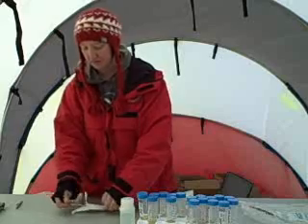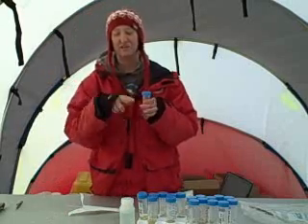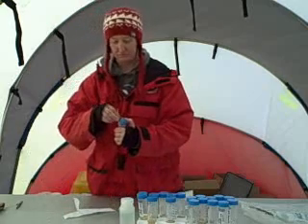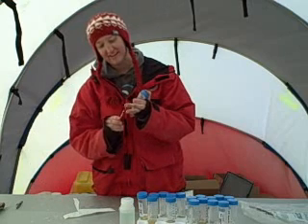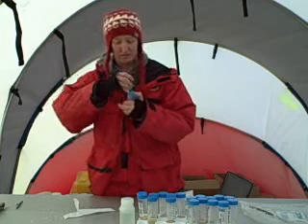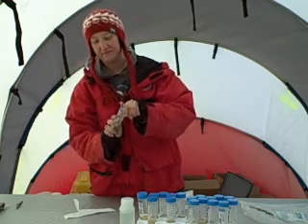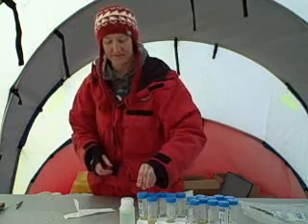So what we're going to do is put a little bit of media on the swab. We're going to swab all over my fingers, and then swirl it around into the media. Get it all nice and gooey. And then we'll swirl it around in there. So there's one. So that's our fingers that's going to go in the cold environment.